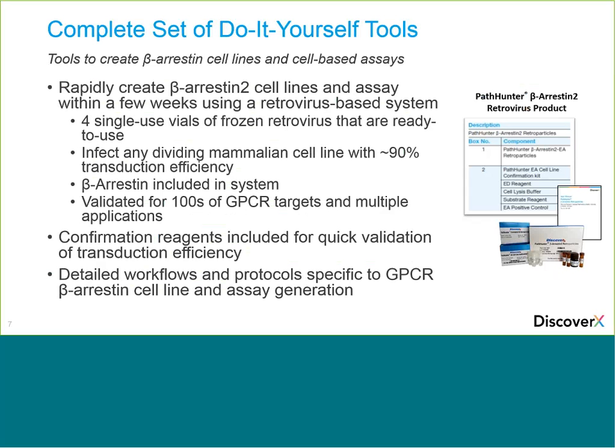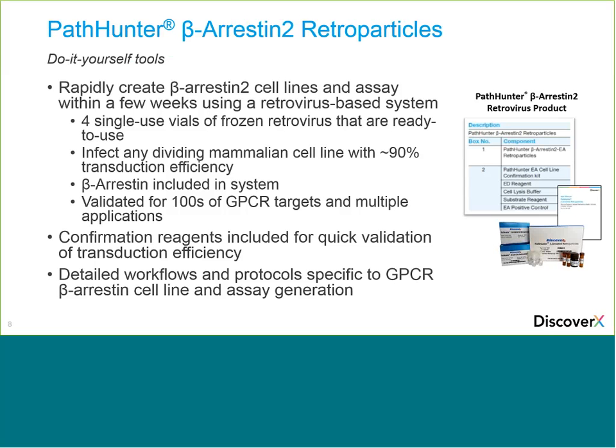Starting with the cell plating, seed your target cells and incubate overnight. And then that first picture where you infect your target cells with a retrovirus and incubate for about 5 hours. Then there's a recovery stage. You change the media. You incubate for 48 hours. You do an antibiotic selection with fresh media and in the presence of hygromycin. And then you incubate this for about 7 to 10 days under this selection.